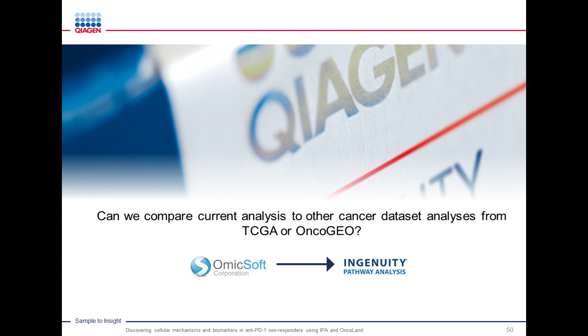So let's take it a step further. So far we've been comparing only two groups from the data set that we are studying, which is the anti-PD1 non-responder data set. But there are other data sets out there in TCGA and GEO that have to do with renal cell carcinoma. So now the question is, can we compare the data set we are studying with public data sets from TCGA and GEO and see if the mechanism of action is similar or different across these different renal cell carcinoma data sets?